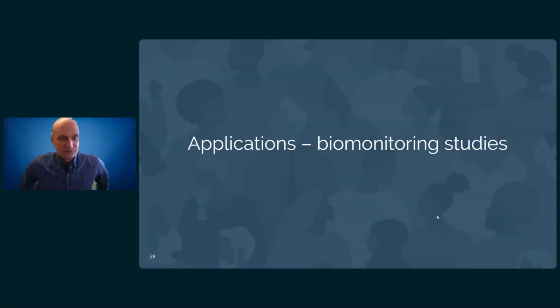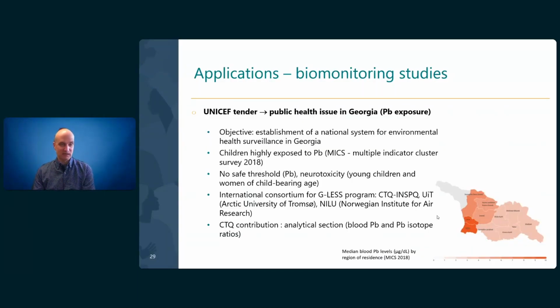Then we applied this new method and this new approach of sampling to real applications in biomonitoring studies. The first one I want to share with you is a UNICEF tender in January 2022.